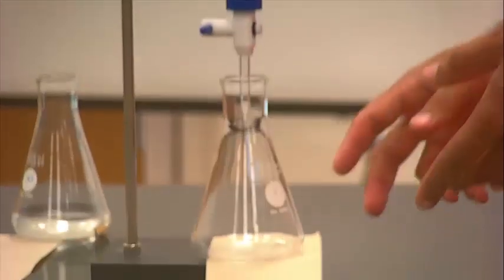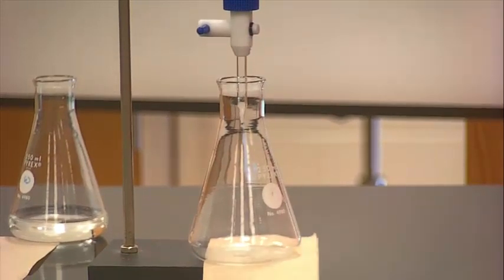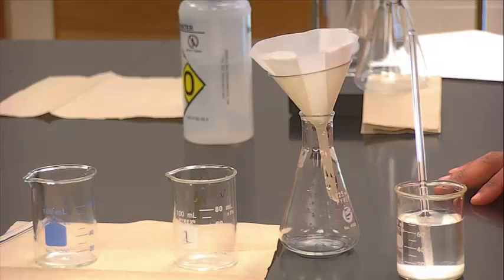So let's go ahead and repeat the experiment one more time. And the volume that you got in the first trial should equal, within reason, the volume you get for your second trial. So make sure you do this in duplicate. Concurrently, while you're doing the standardization of the sodium thiosulfate, it may be a good idea to commence preparing your calcium iodate precipitate for the second and third round of titrations.